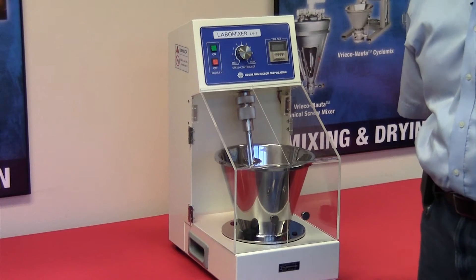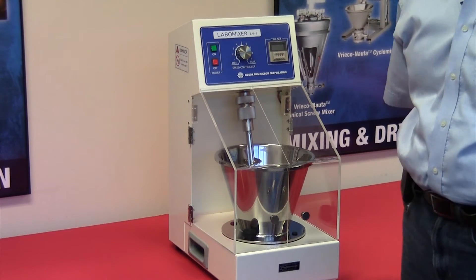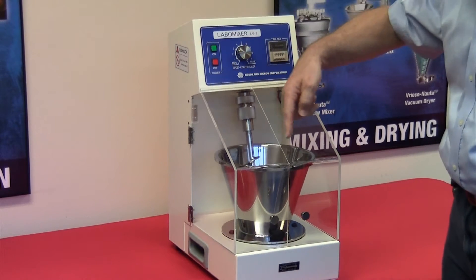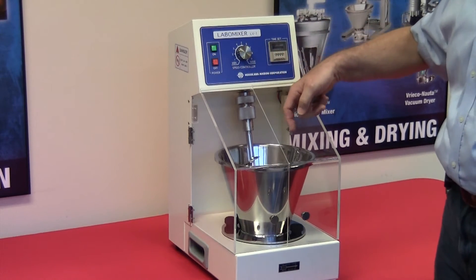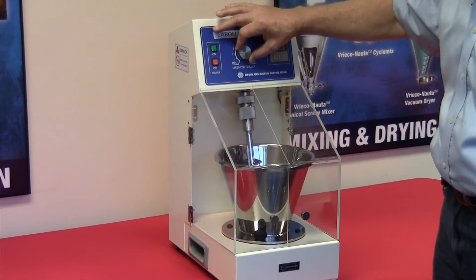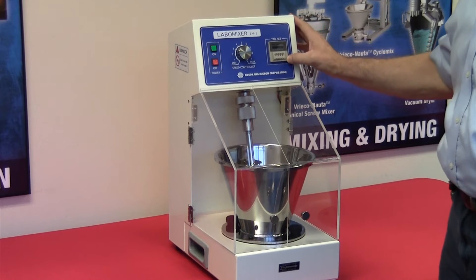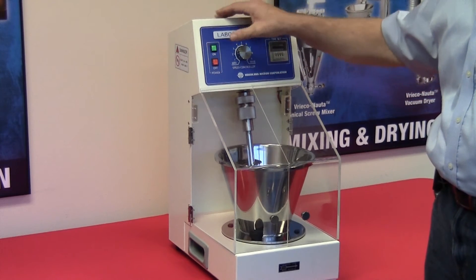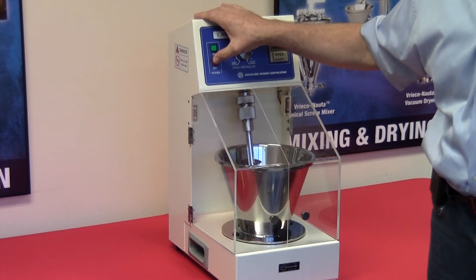As mentioned earlier, operation of the Labomix is quite simple. Press the on button to start the rotation of the bowl as well as the mixing screw. Speed adjustment is done by simply turning the speed controller knob. Time can be preset to allow the instrument to function over a period of time that's desired for your particular mix.